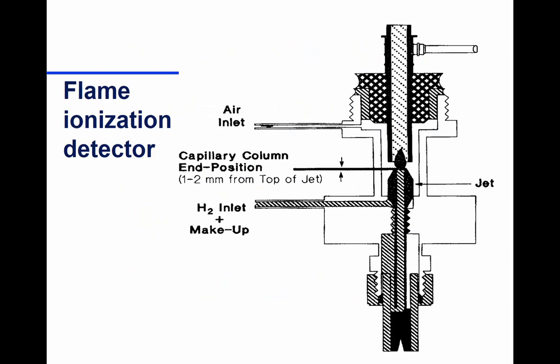So that's the universal detector. That's its advantage. Its disadvantage is it lacks the sensitivity you oftentimes need, and it lacks linearity, because we're using this to measure. We're using it to quantify various components in a mixture. This is our workhorse. This is the one that I've shown you a couple times before already.